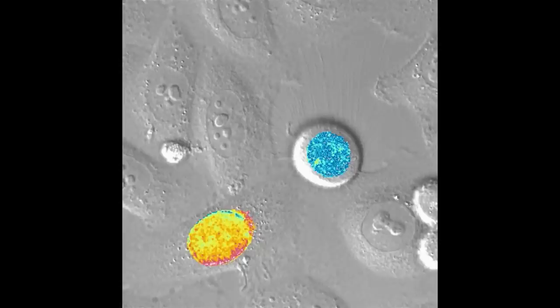Super-resolution microscopy is a new form of microscopy that is now possible. It allows us to look at things with much better resolution than was previously possible. From the smallest, from the molecule to whole organisms, we can now address questions that were unthinkable just a few years back.